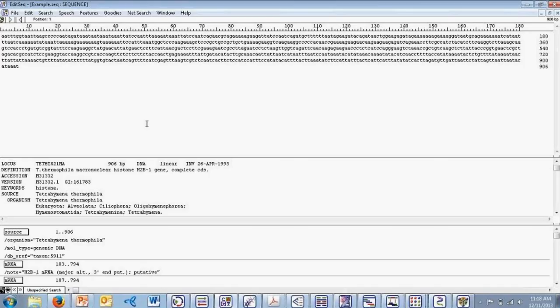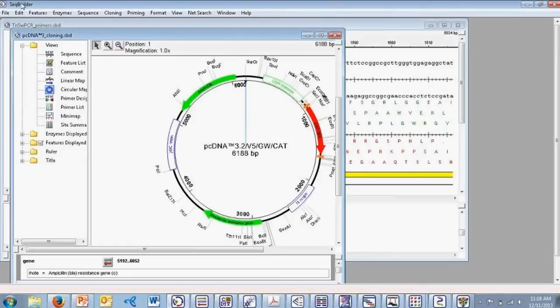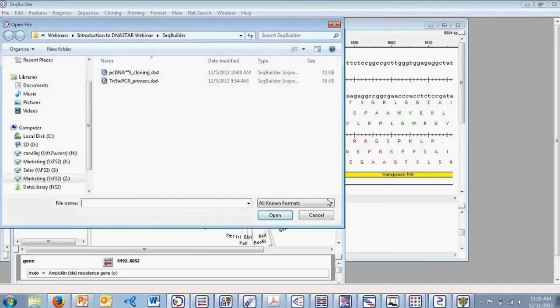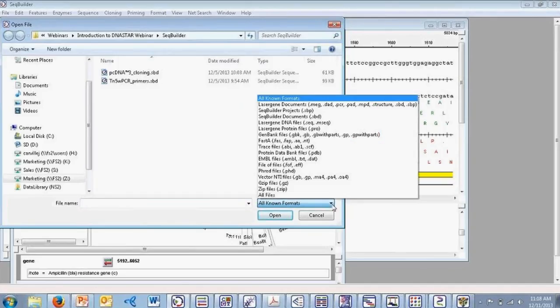We had a question: what file formats does DNA Star accept or work with? DNA Star supports a wide variety of different file formats, as we can see here in SeqBuilder — GenBank files, FASTA files, and many other different file types that you can bring into any of these projects.